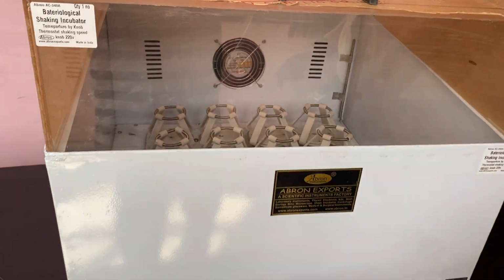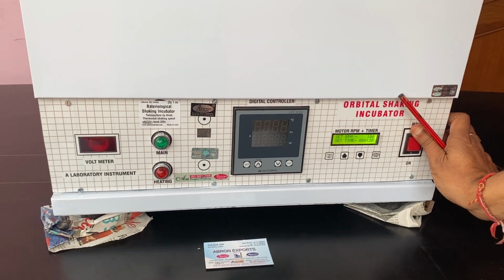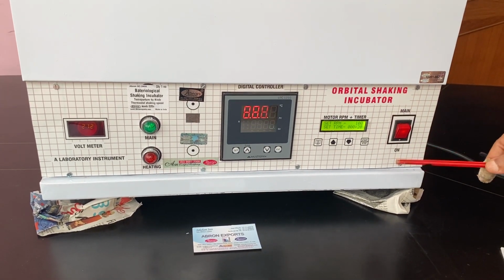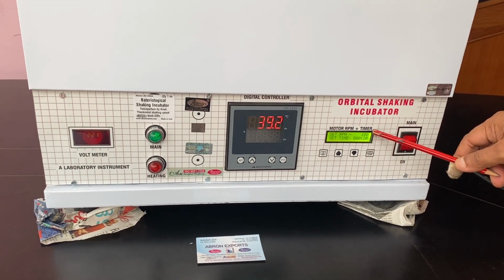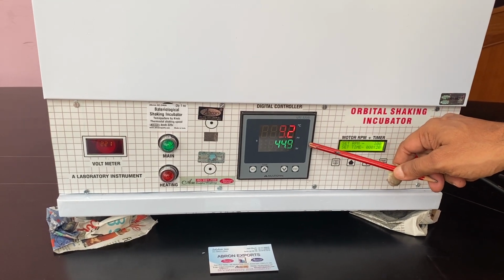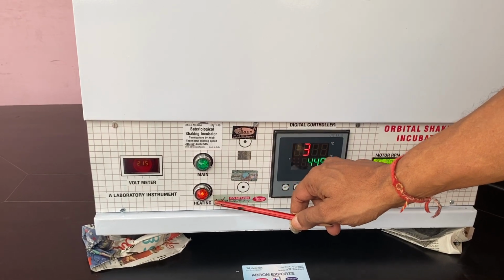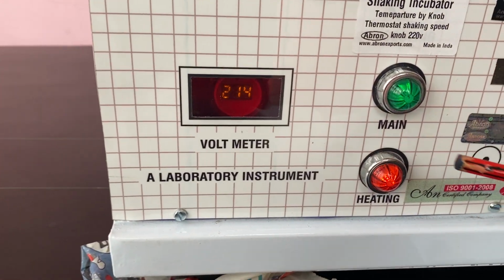Now I go to the panel. The panel has an on-off switch. You switch it off, and then when you switch it on, the switch is on. Then the motor RPM and timer: the upper one is RPM, below is the timer. This one is a digital temperature controller, with mains current, heating increasing or decreasing, and a voltmeter. You can see this is showing volts.